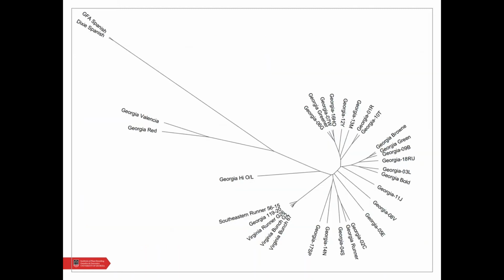The unrooted dendrogram shown here was created using UPGMA. Two small clusters form a primary outgrouping. These are the subspecies fastigiata entries. The Spanish cultivars are circled in brown, and the two Valencia cultivars in yellow. We had really good separation of these fastigiata subspecies examples. We were really happy to see that.